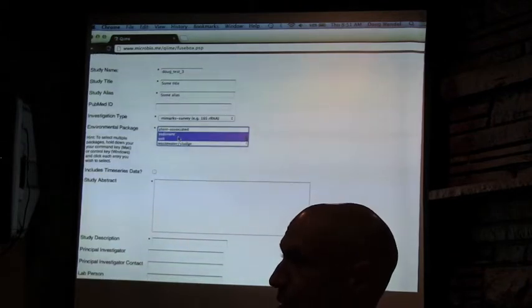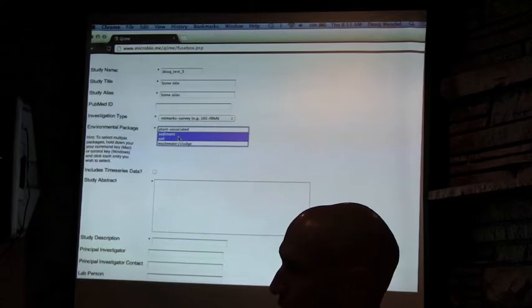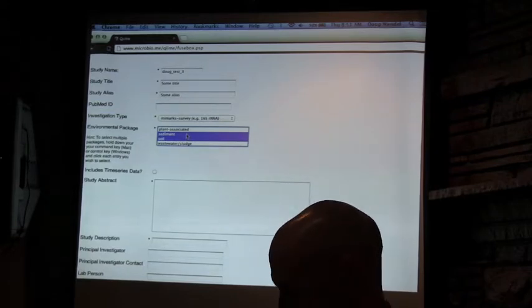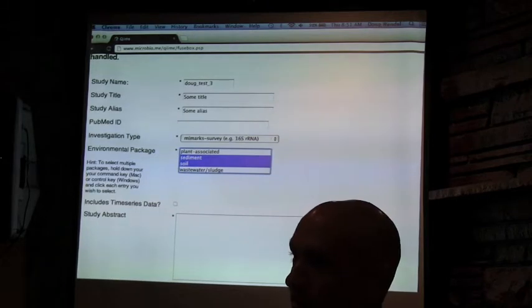Yeah, when is the built environment package going to show up there? I actually have almost all of it scripted out, so it'll probably be maybe a week or something like that. I just didn't want to introduce a brand new package before the seminar started. Doug, yeah. Can you increase the font size? Oh yeah. How's that? Better.